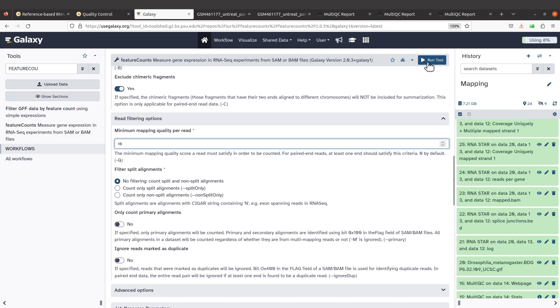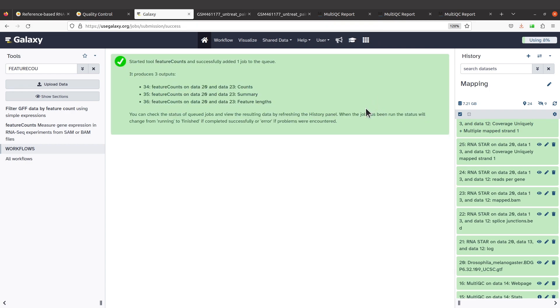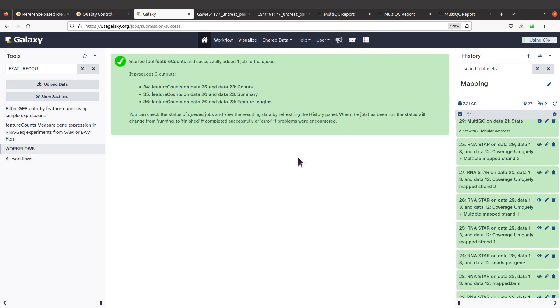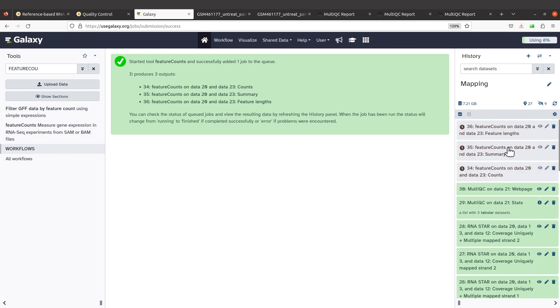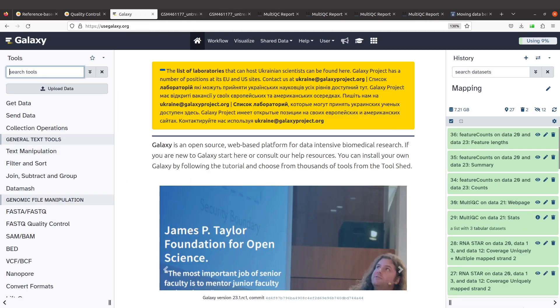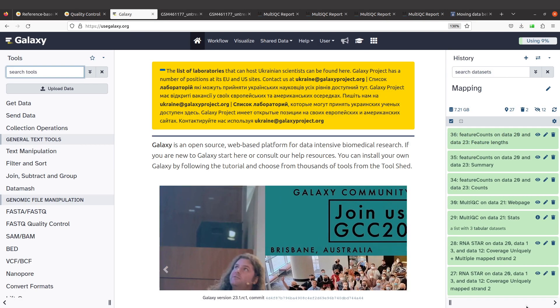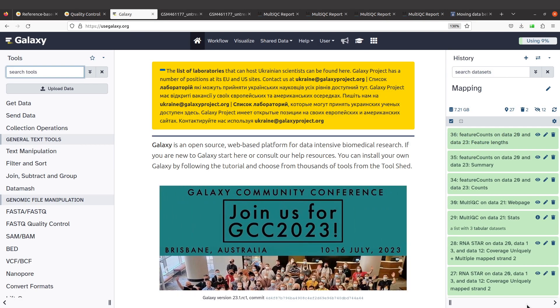We will run the tool now. We are running feature counts and will wait for it to complete its work. Feature counts has completed its work.